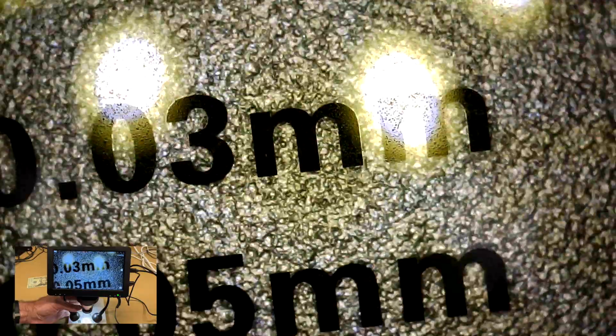So you could use this for inspecting things. So this isn't just necessarily a fun toy or for research. This can also be used for purposes of inspection in a shop or a lab or things like that.